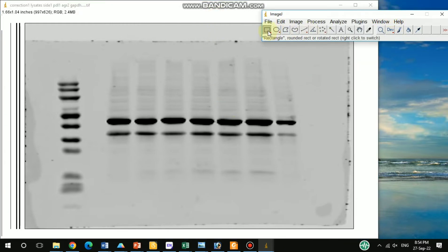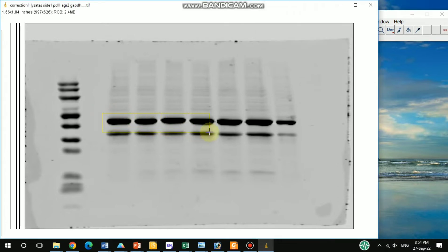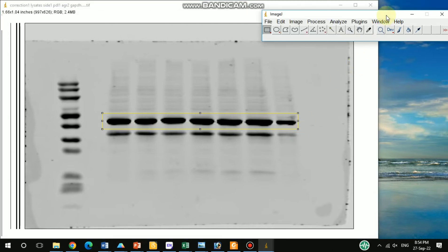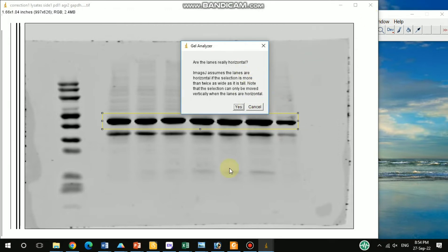First, you need to select the rectangular selection tool. By choosing this one, you will get this kind of option to select. You need to select the entire band. After that, press Ctrl+1.